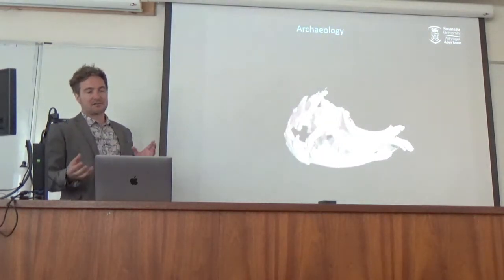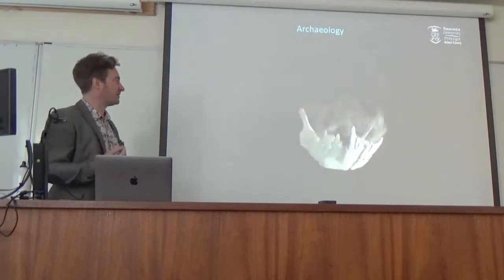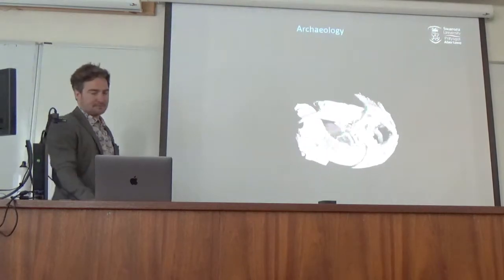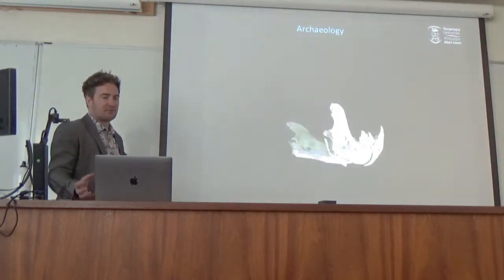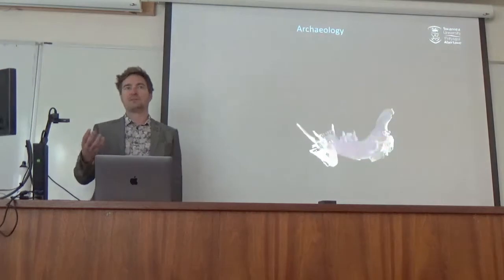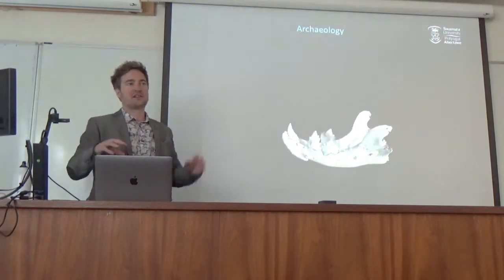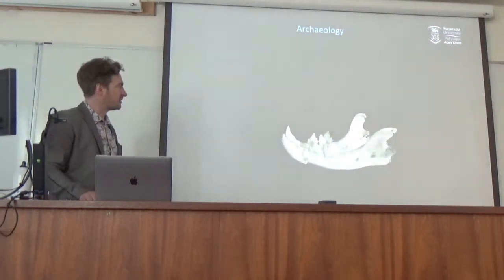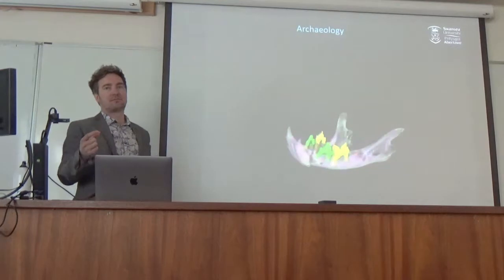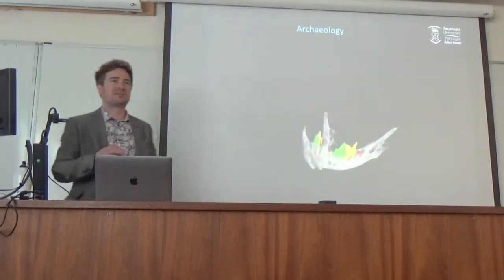So we could isolate, digitally unwrap, and then look at regions of interest to get higher resolution scans of this mummified cat. And we can see huge amounts of damage to the jaw, so the jaw is fractured. This was one of the challenges with working remotely. The expert potentially aged the cat from images, but when I was delving through the data, and when you do region of interest scans you can generate a lot of data on an individual sample, I started to notice that the teeth were interesting. When you're aging something, the dental eruption is one of the metrics that you'd use. But then I noticed these unerupted teeth just under, and you wouldn't really see them from the other visualizations.